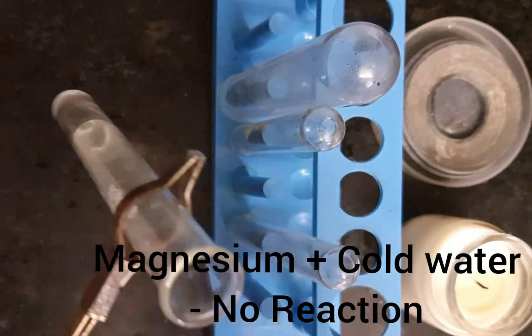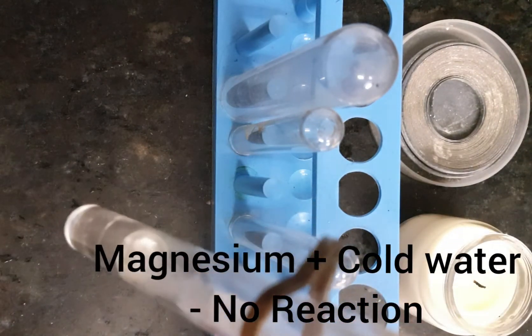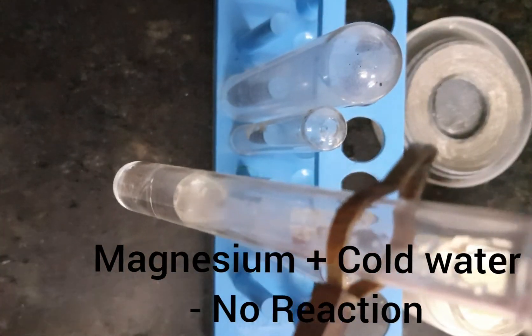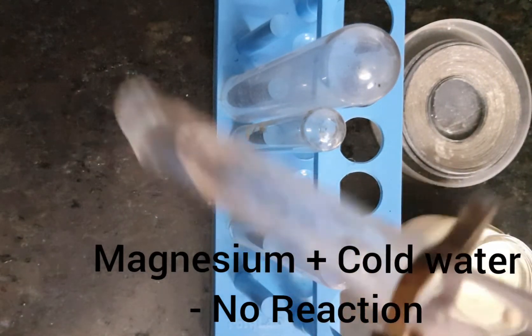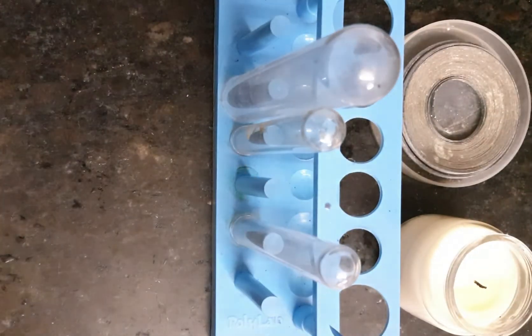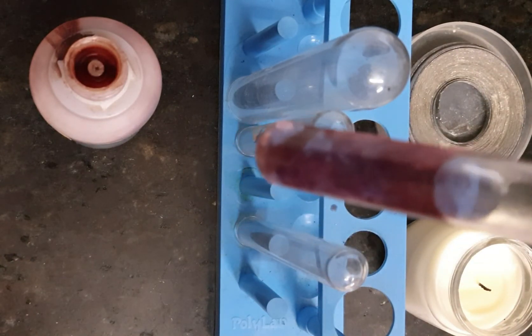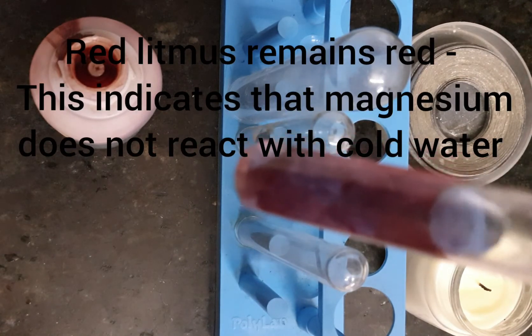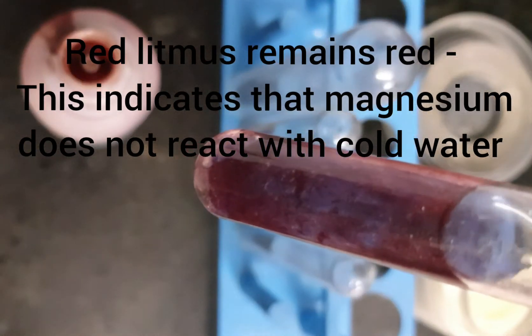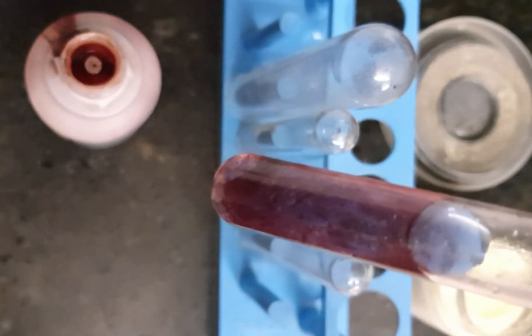I am using this red litmus and putting a drop of it into the test tube. See, the red litmus is not changing — that means there is no reaction between magnesium ribbon and cold water. Now we will see what will happen if we slightly warm up this water, whether the reaction will take place or not.